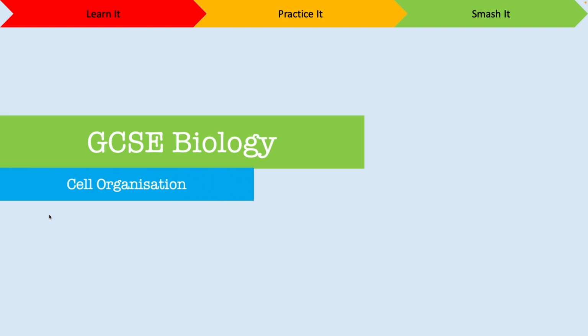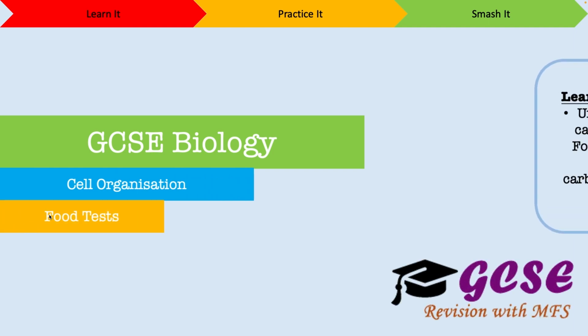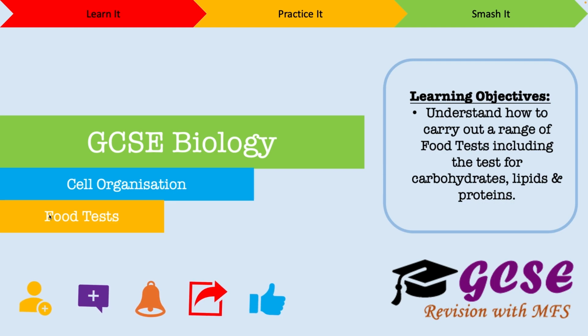In this video, we look at the required practical for food tests. We focus on the method used to carry out this required practical and the key observations you would see.